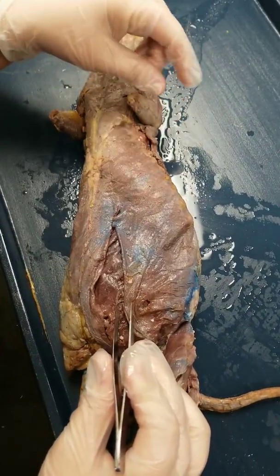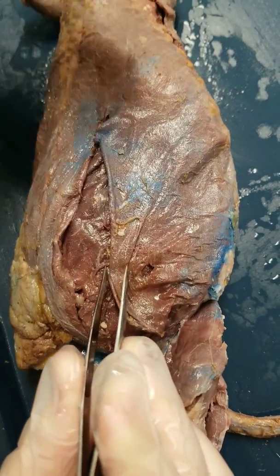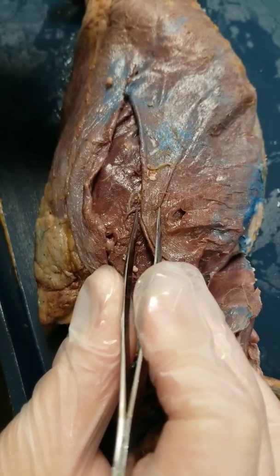In this video we're going to dissect the remaining muscles of the mink. We're going to dissect the abdomen, the chest, the back, and the upper leg.